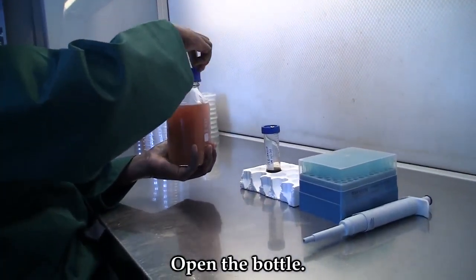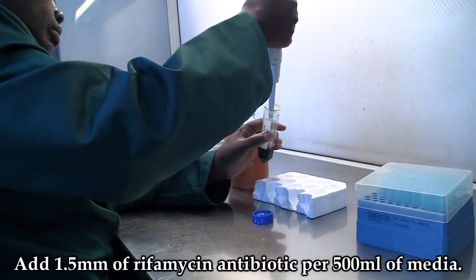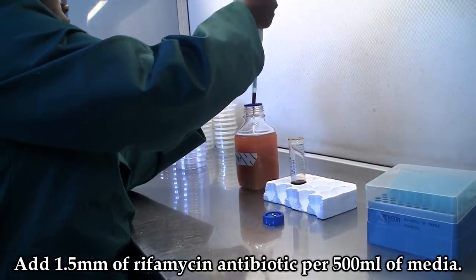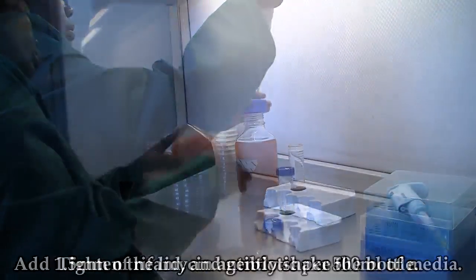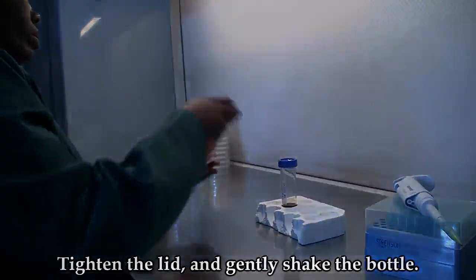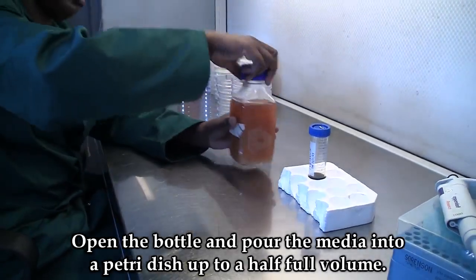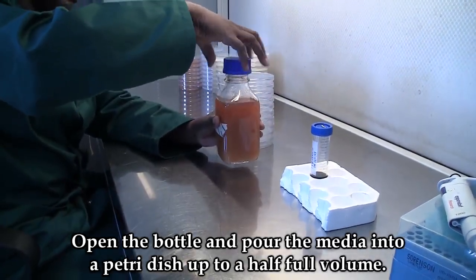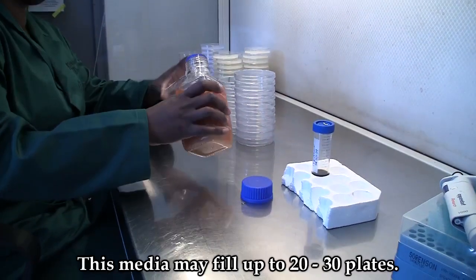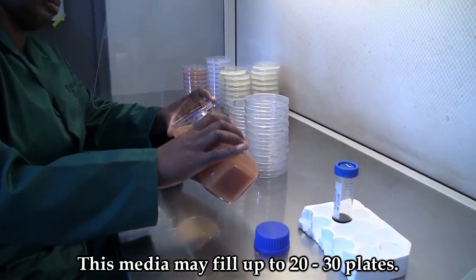Open the bottle and add 1.5 ml rifamycin antibiotic to 500 ml of media. Tighten the bottle and give it a small shake. Open the bottle and pour the media into the Petri dish up to a half full volume. This media may fill 20 to 30 plates.